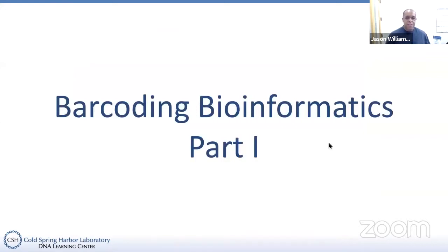So let's get into the lesson. There are a number of parts that we have, a number of goals for today. I'm also going to be getting some assistance from folks who are helping me with questions. So if you're watching us, you may want to make sure that you're actually watching us from YouTube Live. Then you'll be able to take advantage of the chat function.